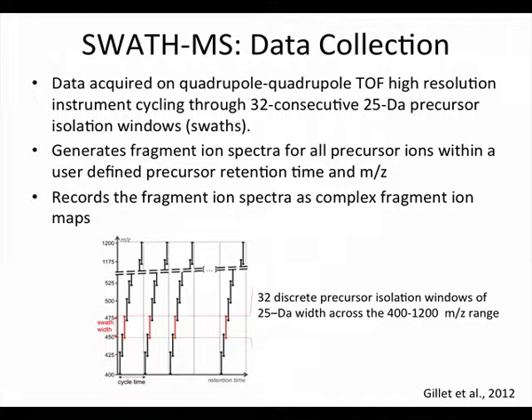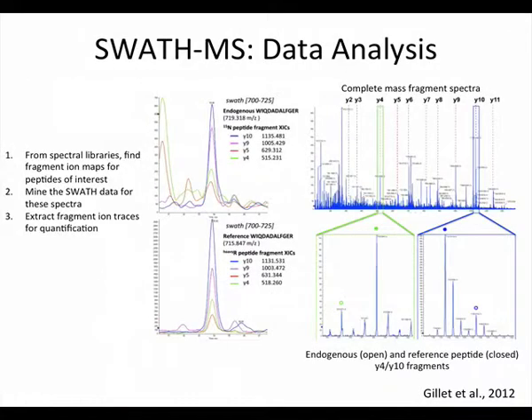So it's sort of more similar to discovery based, but it's actually building in the fragmentation and the data collection that are used in MRM. So you're getting a little bit more of a messier data set, but you're getting a lot more information. And I think with time, this is a pretty new method, but as we get better at actually doing the informatics afterwards to figure out exactly what's happening, it will become a much more used method.